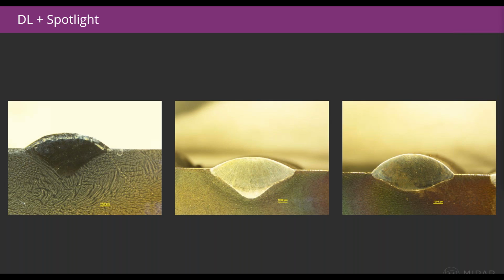This is just a sample of the data. There are many more images, but these few represent a decent spread in the variation that the solution needs to accommodate. There's certainly nothing in common that a threshold could pick up on. In one case, the bead is darker than everything else. In another, it's lighter than everything else. And in a third, it's somewhere in between.